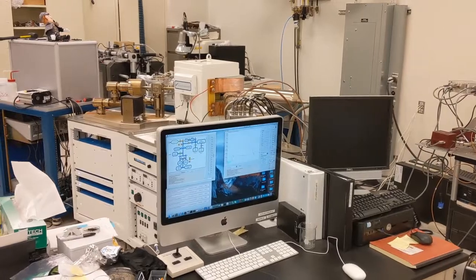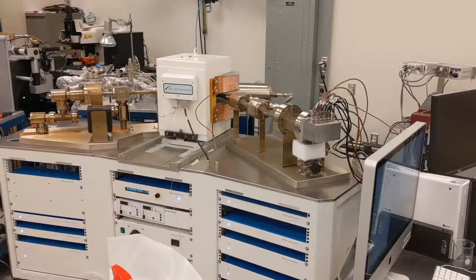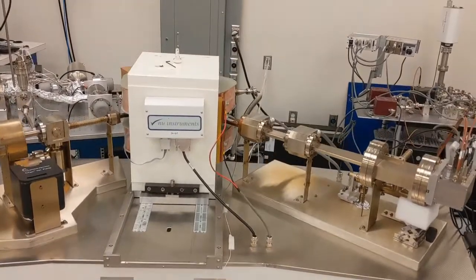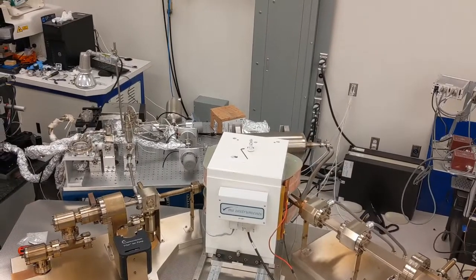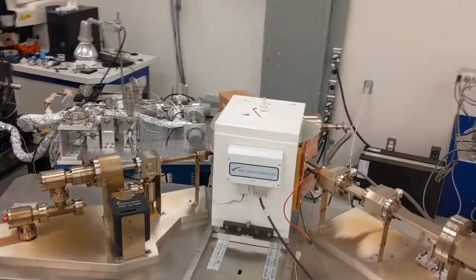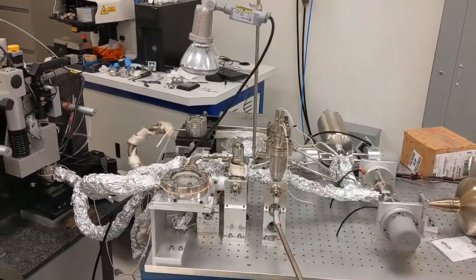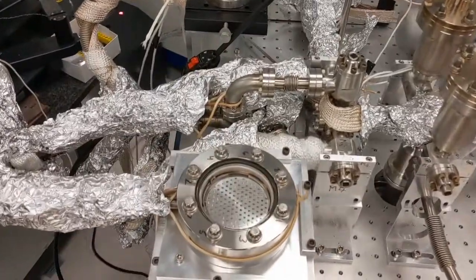Here is a new Noblesse magnetic sector noble gas mass spectrometer. Our lab has two of these instruments, which we use for argon geochronology. Argon-40 is the product of radioactive decay of potassium-40. Due to the ubiquity of potassium in the Earth's crust, argon geochronology is an especially widely used method for determining the age of rocks. We utilize the argon-40/argon-39 method, where a sample undergoes neutron irradiation, triggering the transmutation of potassium-39 to argon-39. This allows for an age to be calculated through a single measurement of argon isotopes.